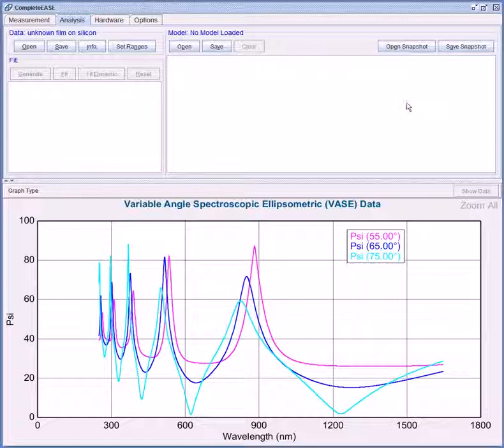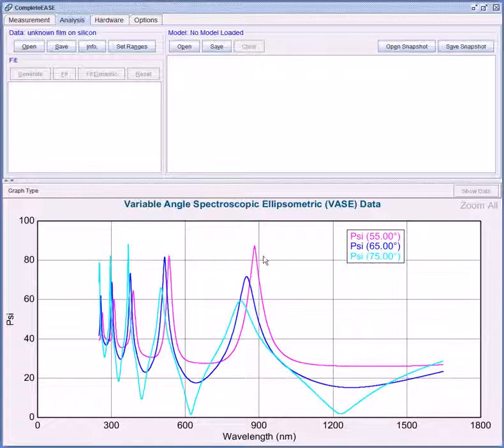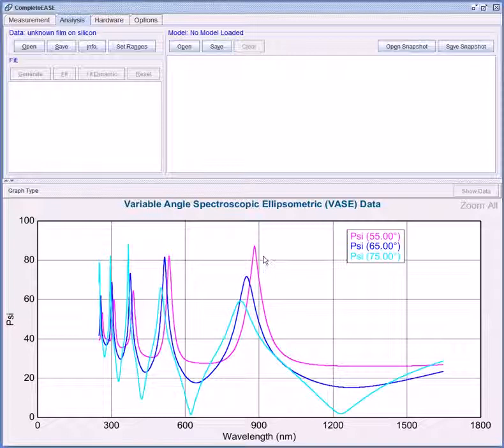I have the data open here and the very first thing I notice is that there are clear strong oscillations in the data. This is a telltale sign for a transparent material.